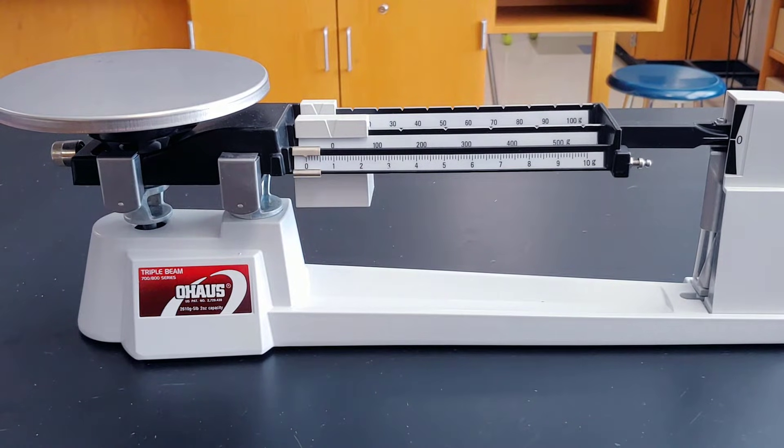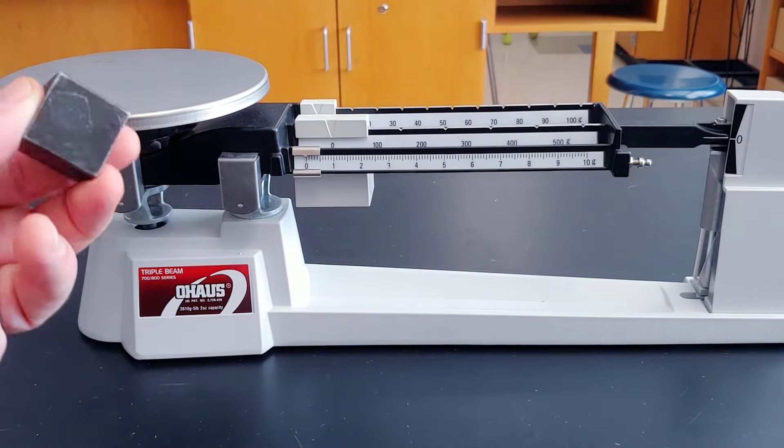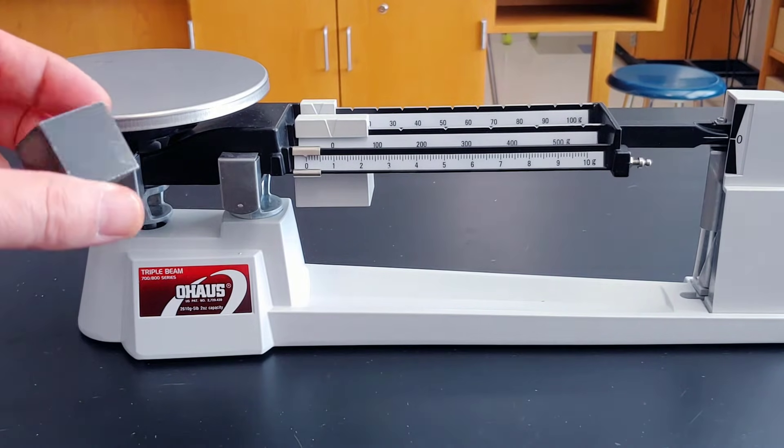The triple beam balance is one of the most common instruments you'll be using in science class, and you use it to find mass in grams. Today, we're going to find the mass of this iron cube.